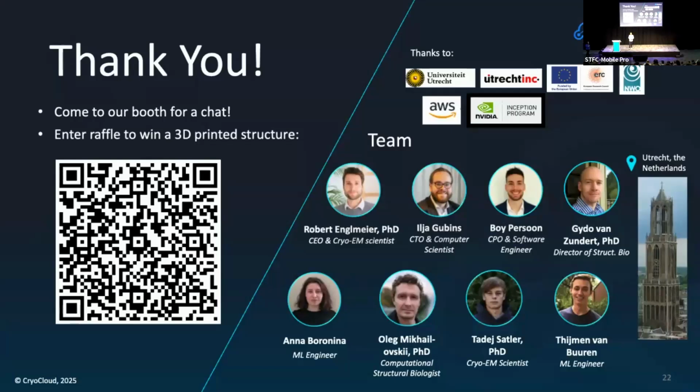Final question there, please. Maybe it's too early. Are you considering expanding to ET as well, ET processing? We do have a prototype for cryo-ET. So yeah, please reach out if you want to know more there.